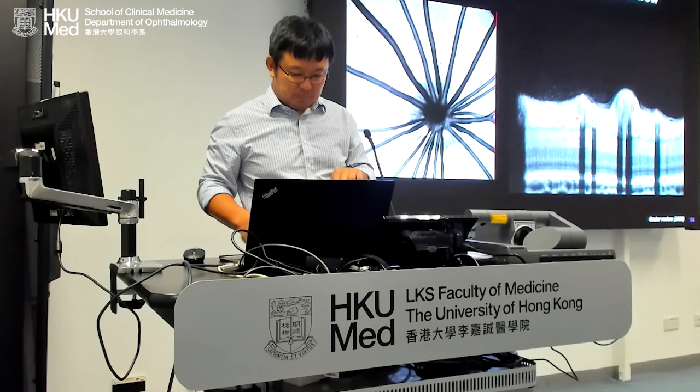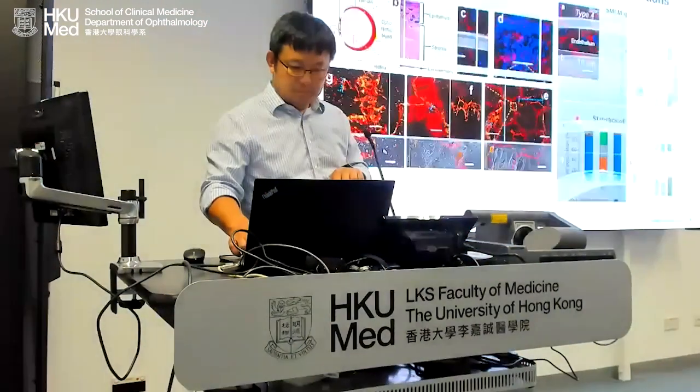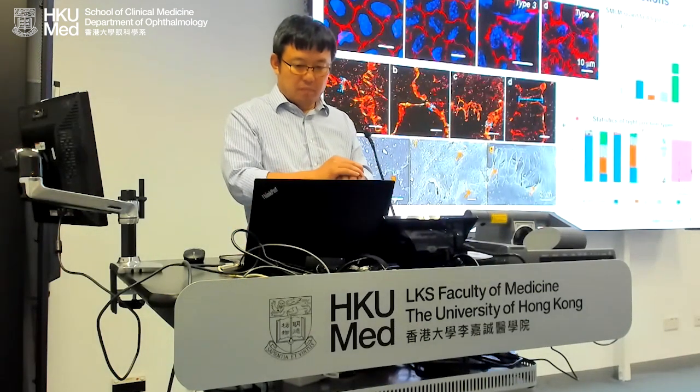One final question for me. You showed beautifully that the super resolution microscopy is useful to delineate better the structures of the tight junction. Can you go back to that slide? I have a question on that. Based on the conventional fluorescent microscopy, we can already see some differences. The 4 types, top panel. I'm pretty ignorant on the second panel here. What are the structures, and how much information does the super resolution microscopy add on top of what we can see already with conventional microscopy?